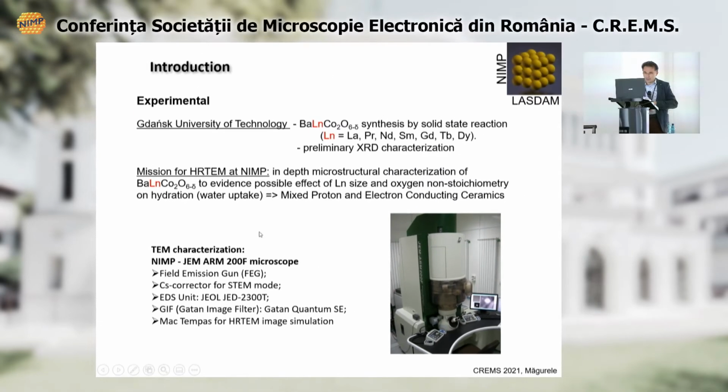So as I told you, this is part of a collaborative research project. The samples have been produced in Poland at the Gdańsk University. They have produced several samples where they used for lanthanide the whole series of ions, and they performed also preliminary XRD characterization. Our mission by HRTEM at NIMP was to perform an in-depth microstructural characterization of the compounds to evidence possible effect of lanthanide ion size and oxygen non-stoichiometry on hydration for developing mixed proton and electron conducting ceramics.